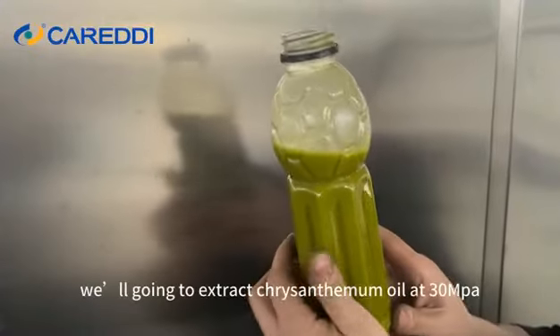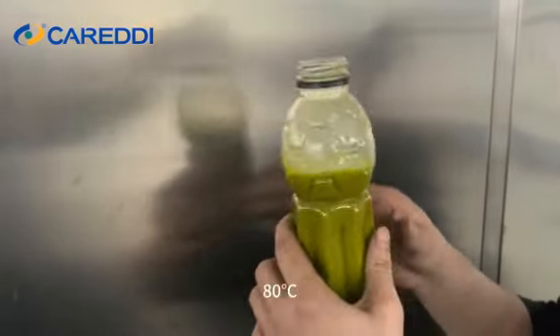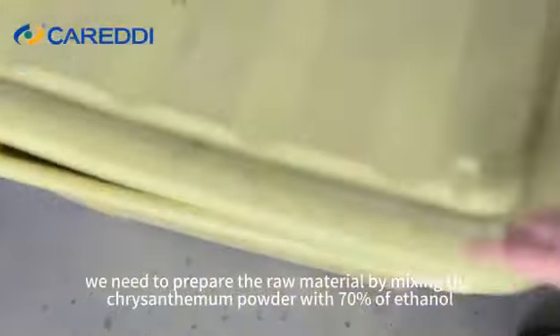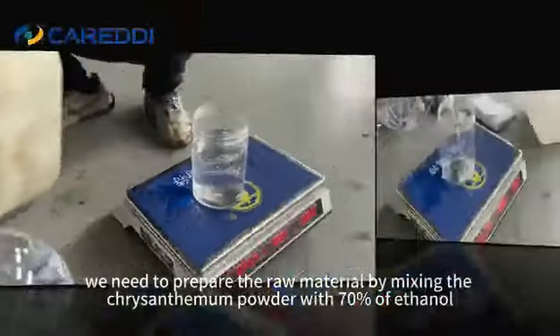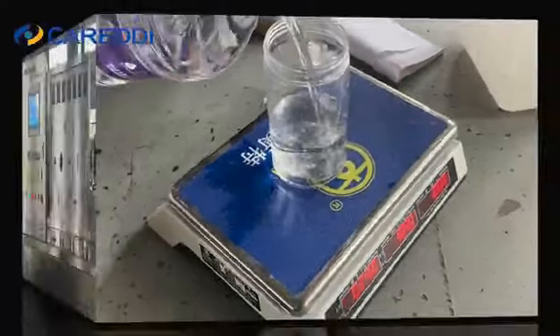In this video, we're going to extract chrysanthemum oil at 30 MPa, 80°C. We need to prepare the raw material by mixing the chrysanthemum powder with 70% ethanol and let it soak for about 1 hour.